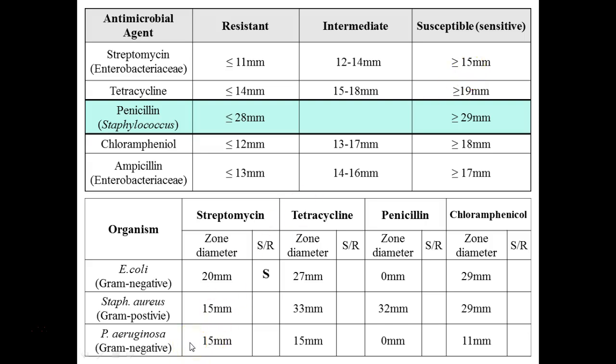Sometimes I do those plates. This time I didn't feel like it. This is another gram-negative, but it's resistant to a lot of antibiotics. And that's one of the reasons why I usually do those plates for you guys, so you can see that only like 1 or 2 end up working.